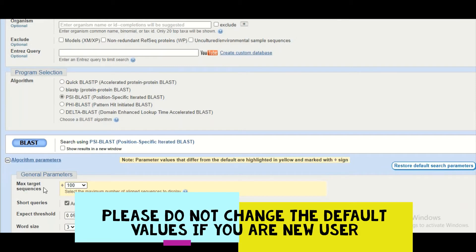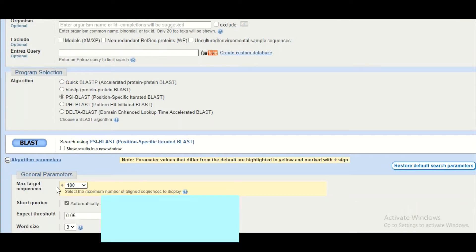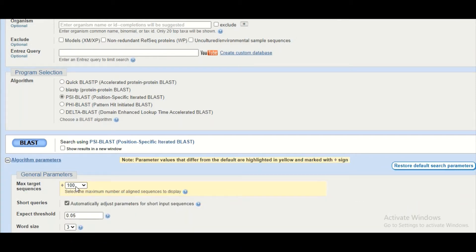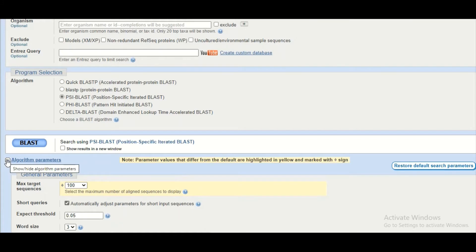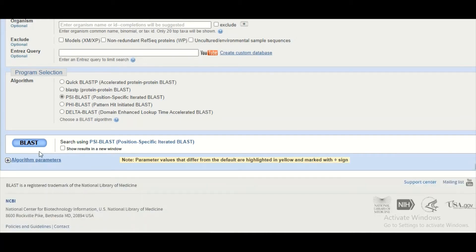Right now for this tutorial we have changed the maximum target sequences from 500 to 100 to complete our search quickly, but we will not recommend you to change the default algorithm parameters otherwise it will disturb your results. Then we simply click on this BLAST button.